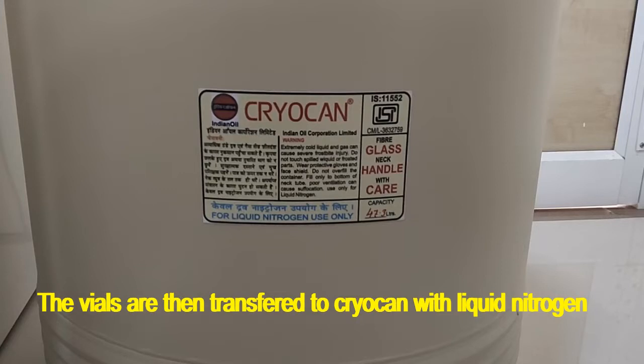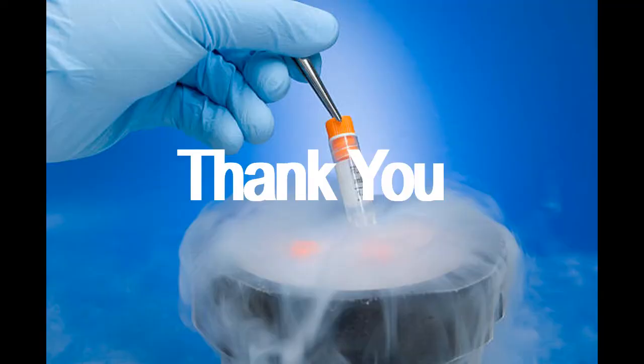The next day, transfer the cryovials into a cryo can containing liquid nitrogen. This is the complete procedure for cryopreservation of mammalian cells.